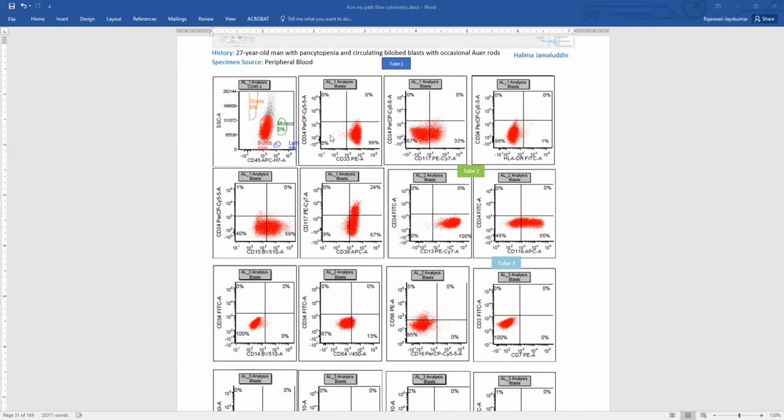And these are negative for CD34. If you remember the myeloid maturation, promyelocytes come after the myeloid blast stage, right? So these blasts are somewhat mature and they got arrested at the promyelocyte stage. So they don't have CD34 anymore because they are more mature than the CD34 positive myeloid blasts. And therefore they are already expressing bright CD33 and CD13. And they have lost HLA-DR again because they have matured to the promyelocyte stage, and they express CD117, and they're actually in the process of losing it also.